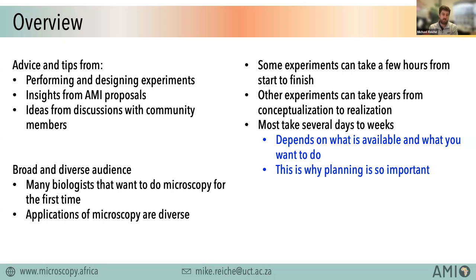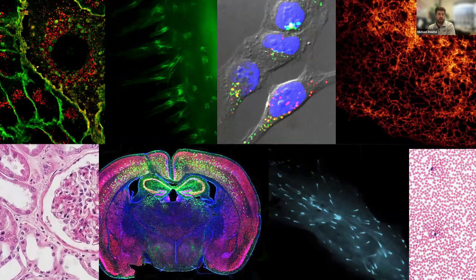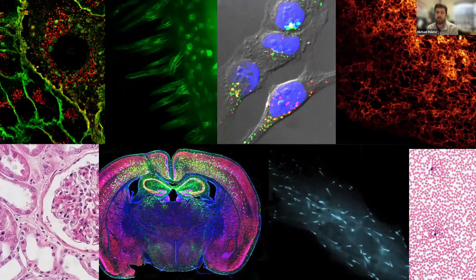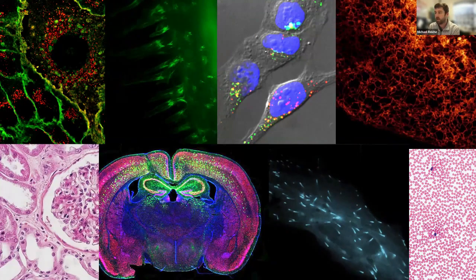But because of this massive time and resource commitment, it's very important to plan your experiment as best as you can. And to highlight that there is a lot you can do with microscopy, I'm going to be relatively general in my talk now, but I'm hoping that you'll be able to identify tips and tricks and ideas that will benefit you in your pursuit of microscopy experiments.